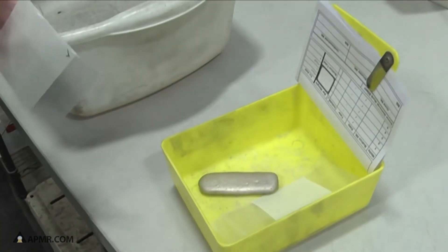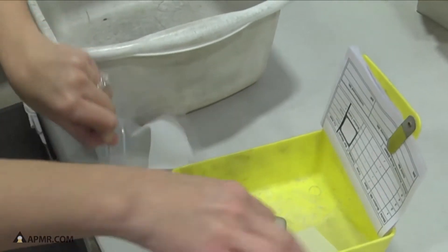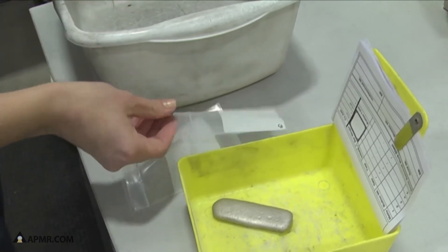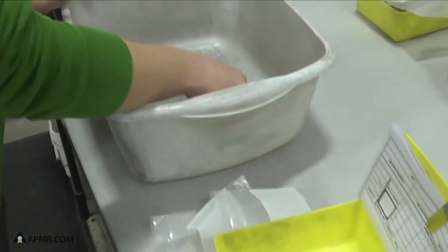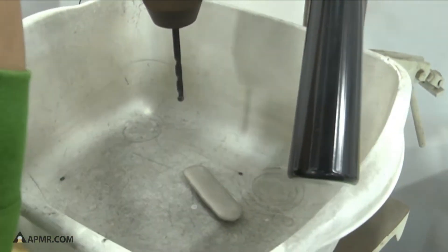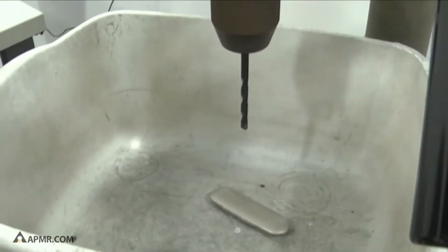We're going to do drill samples now from this bar. This bar has passed the test for homogeny, and we're going to first put the bar into this pan and get underneath our drill press to drill the top side of this bar first.